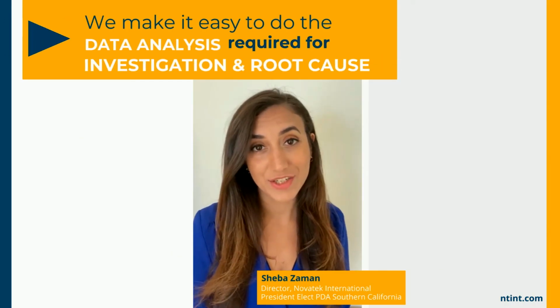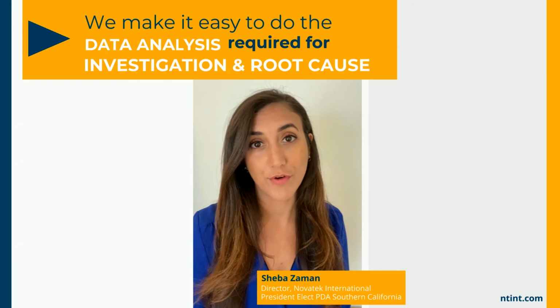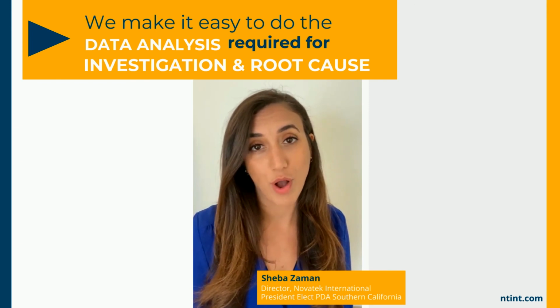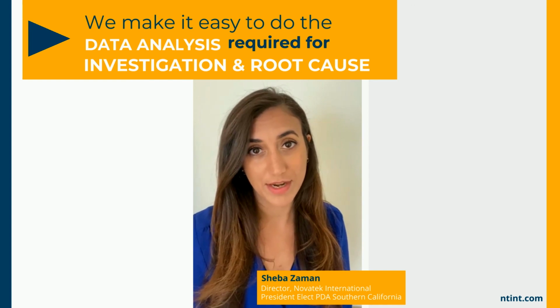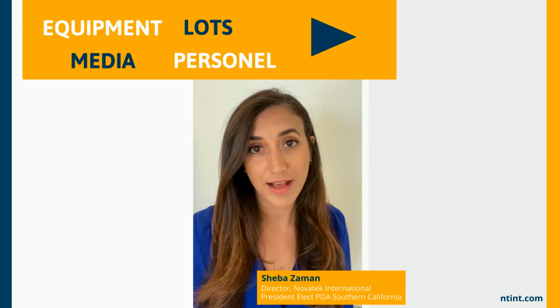We make it easy to do the data analysis required for investigations and root cause. You can trend on any of the factors that could potentially affect contamination, such as equipment, media lots, personnel, and much more.